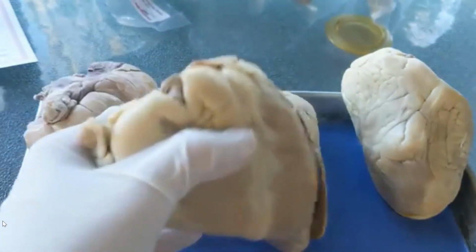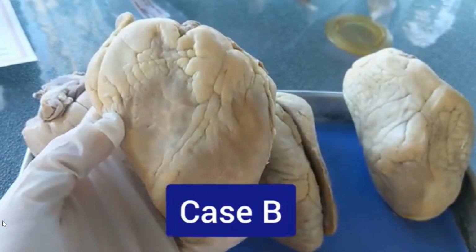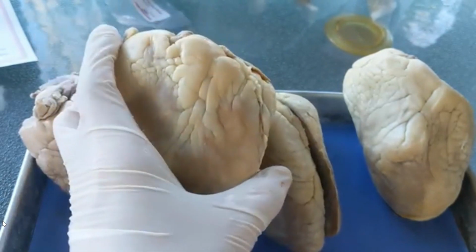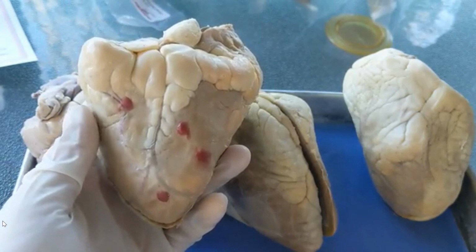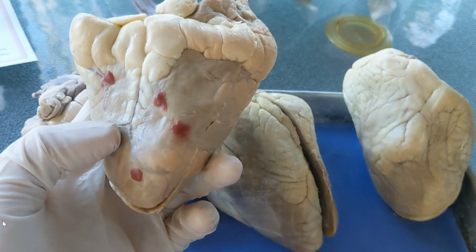Here is patient B. And again, we're going to start with the external. I like to look at the front of the heart first so I can see the coronary artery crisscrossing. That's how I know it's the front. And then I'm going to flip it. Ooh, dang. Yeah, that's not good. So you want to look at the coronary artery, see if you notice anything.